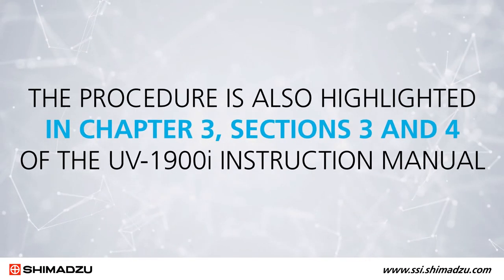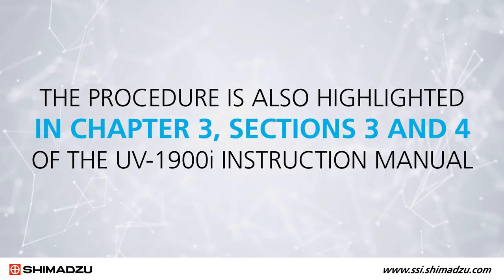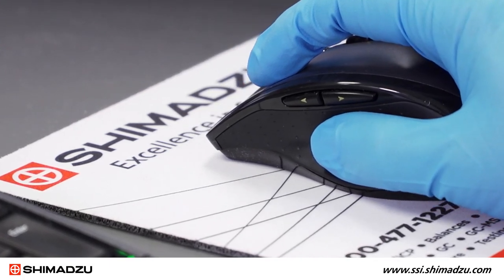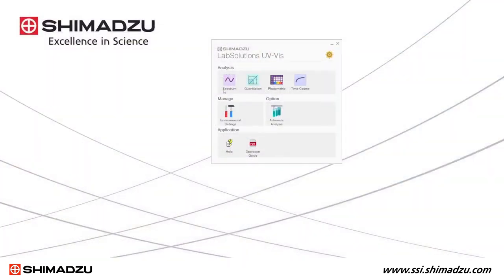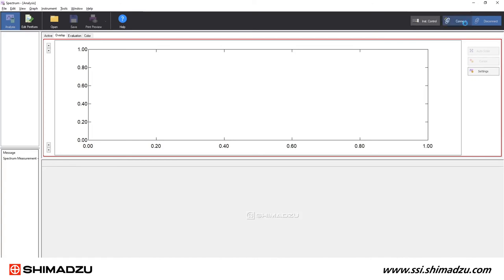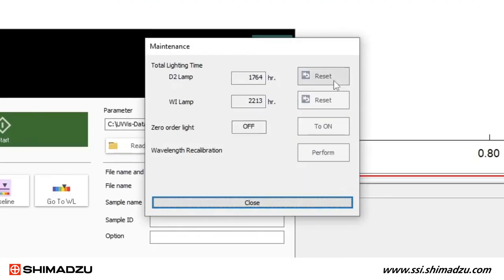The procedure is also highlighted in Chapter 3, Sections 3 and 4 of the UV-1900i Instruction Manual. For spectrophotometers that only operate from a PC, reset the lamp hours using the LabSolutions UV-Vis software. Select the spectrum mode and once the application launches, click the Connect button in the upper right. Once instrument initialization is complete, click the Instrument drop-down in the upper toolbar and select Maintenance. Then click Reset next to both the deuterium lamp marked D2 and tungsten lamp marked WI.